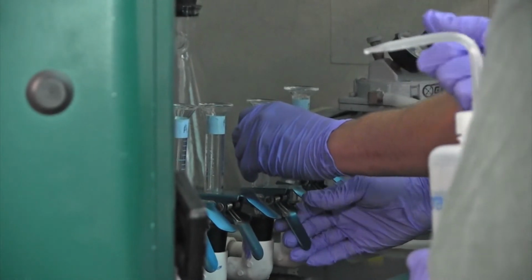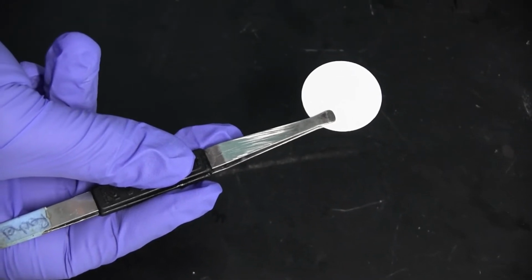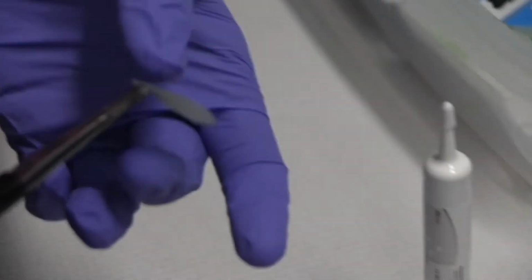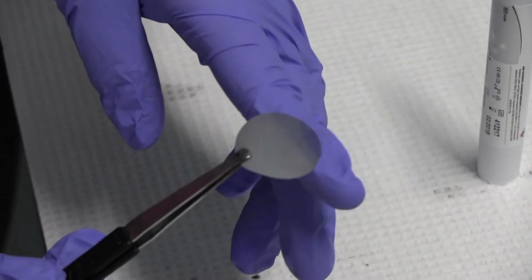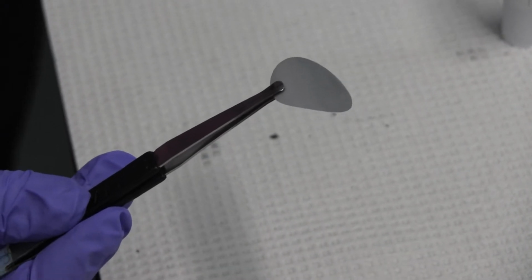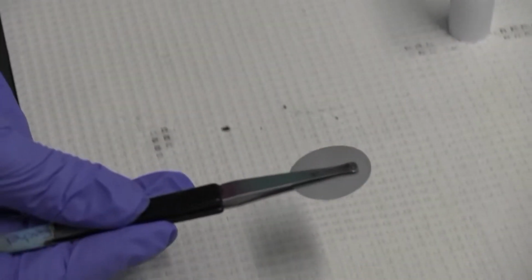But in between there, we need to put a backing filter, and the backing filter is a 0.8 micron filter that basically helps evenness of distribution on the filter. And then the actual filter that we use is a 0.2 micron, which is small enough to collect the bacteria on top of the filter. We use a polycarbonate filter so the bacteria actually sit on top of the filter, they don't go into the filter. So then we can do an accurate count.